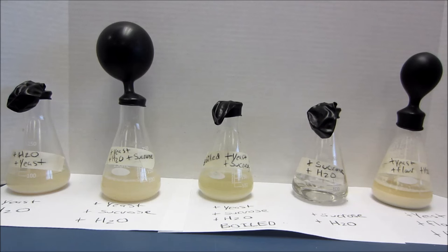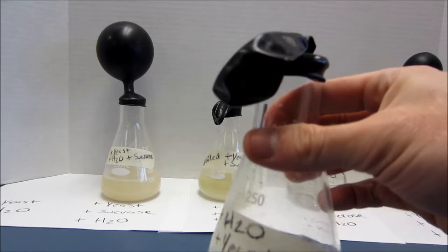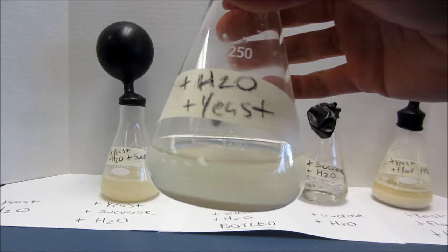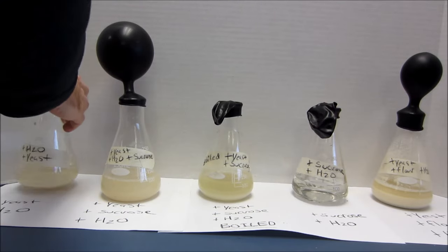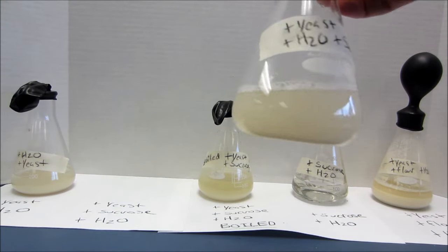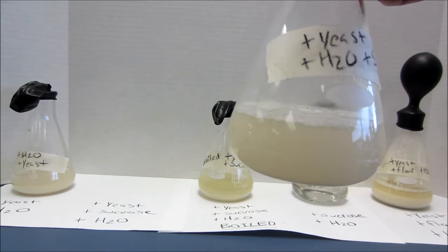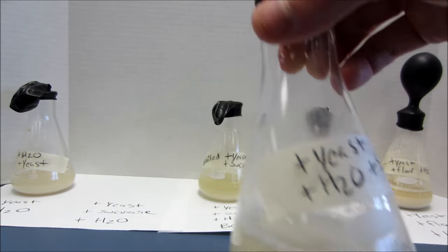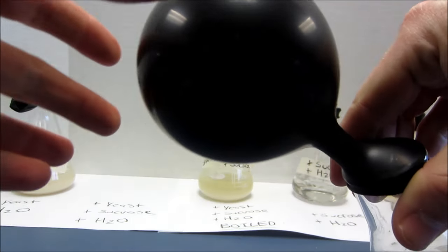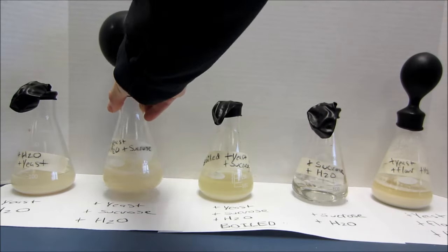All right, it's been 24 hours. Let's take a look at our solutions. You can see all five lined up here. Let's start with the yeast and the water. The balloon looks kind of like it did when we left it. I don't see any bubbles. Looks like no fermentation happened. The yeast, the water, and the sugar, we can see, is nice and foamy in the flask. And the balloon is full of gas, presumably CO2.